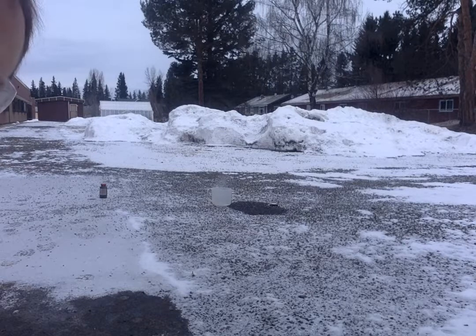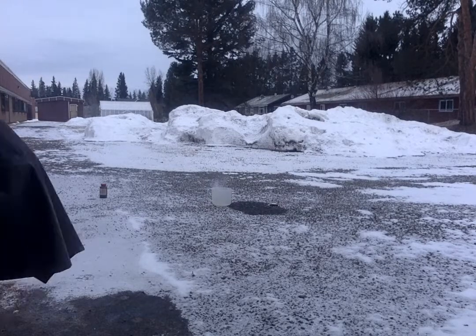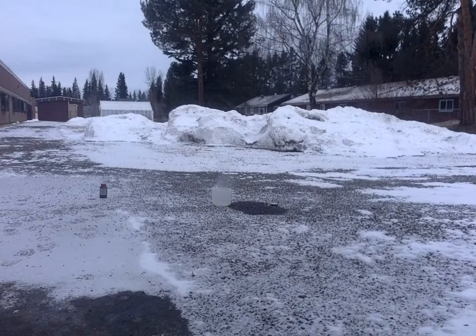So as you can see, the reaction is instant. It's a similar reaction. We have a lot of intense bubbling. If I could get a thermometer in there, we would see a temperature increase. In fact, what we've also got going there, it's too bad we don't have it dark here, but we just had some sparks as hydrogen gas that's created in this reaction is also then burning.